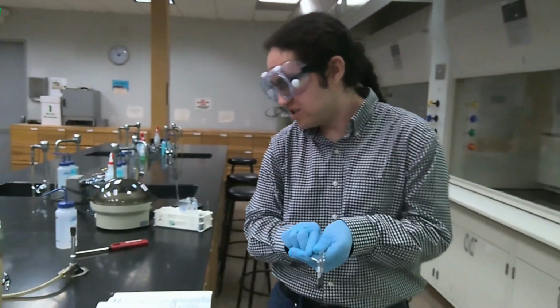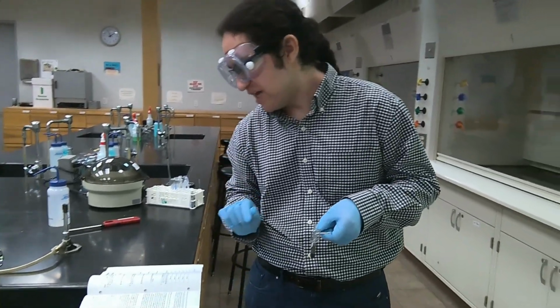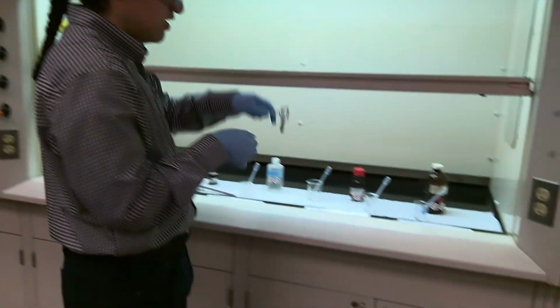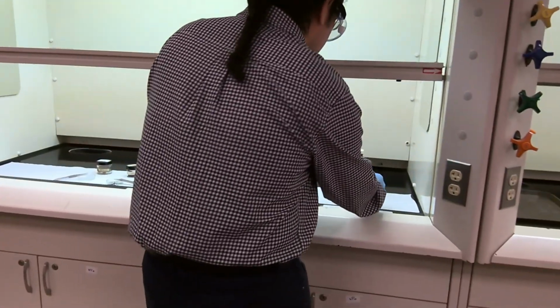Okay, so we're going to dissolve our copper oxide in sulfuric acid. So we're going to add sulfuric acid until this copper oxide completely dissolves.